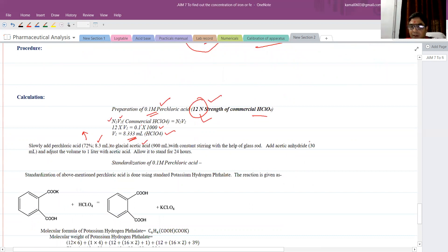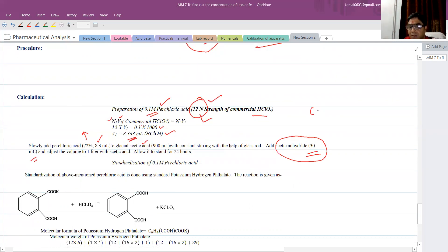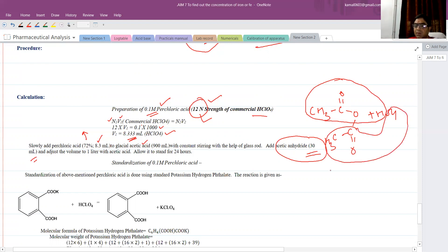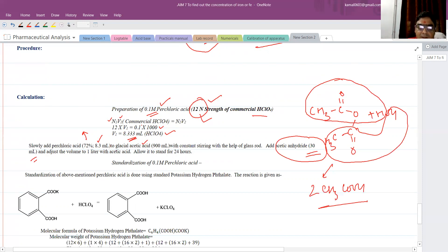Then we stir it and add 30 ml of acetic anhydride. The acetic anhydride will take up any water molecules present in the solution — it reacts with water to form two molecules of acetic acid. Since the 72% perchloric acid may contain about 28% water, we add 30 ml of acetic anhydride to neutralize that water. Afterward we make up the volume with acetic acid, then allow it to stand for 24 hours. This completes the preparation of the perchloric acid solution.